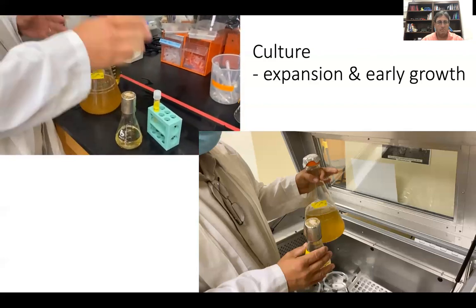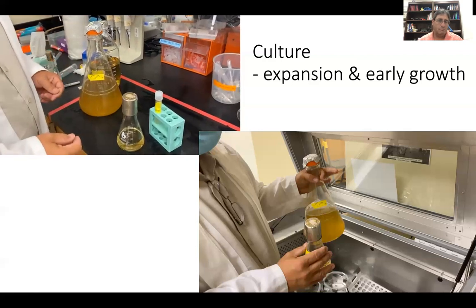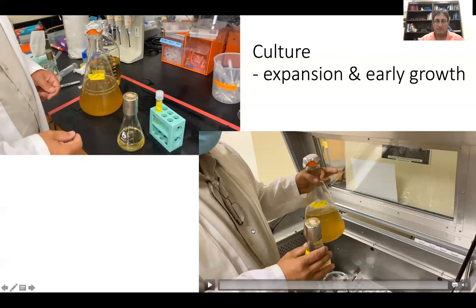Those with the old culture, rinse it in bleach, 10% bleach, rinse it with distilled water, and then wash your glassware as normal. All right, let's continue on.